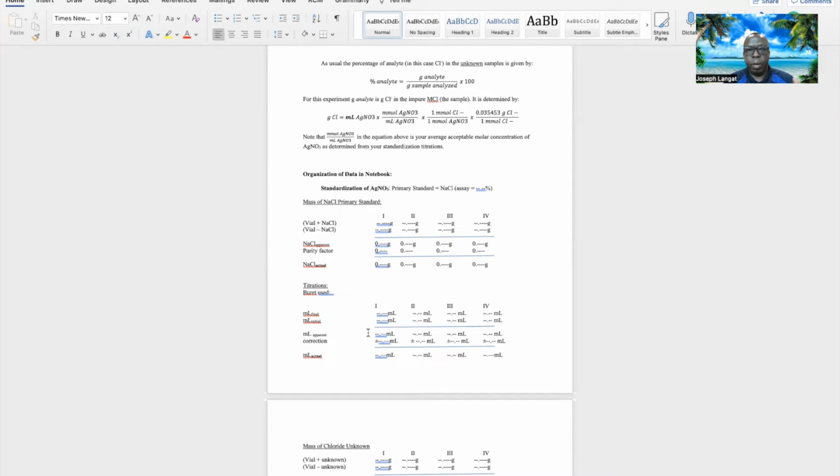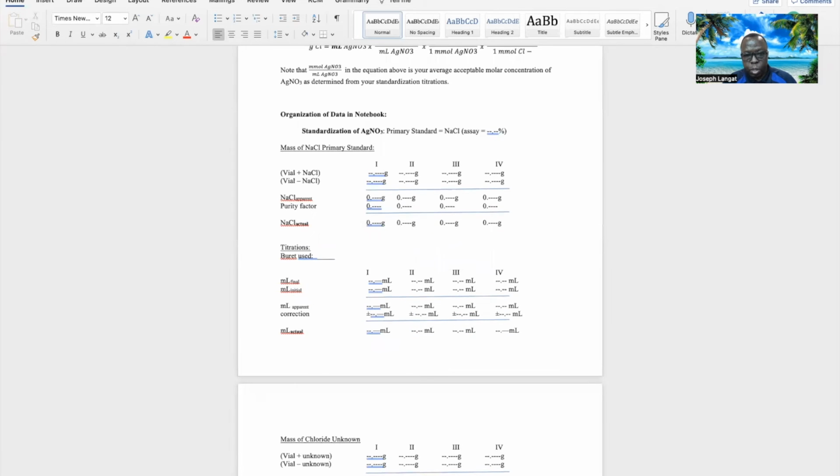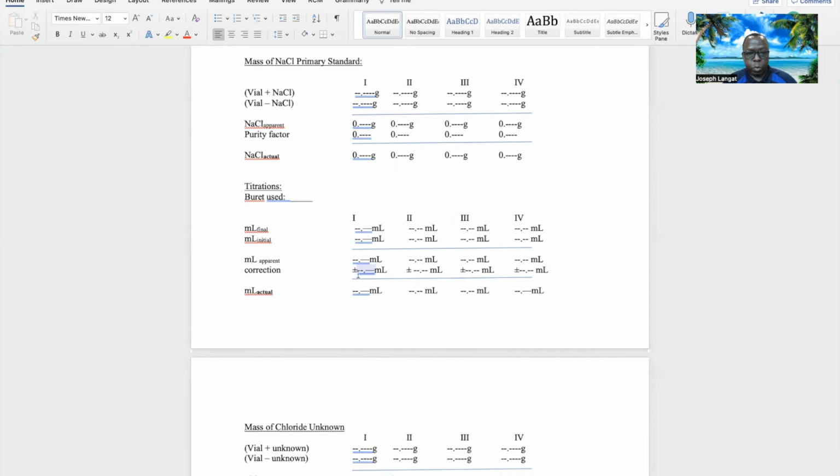I know in the lower level chemistry lab you took, the correction or the volume error from the calibration curve didn't really matter. There is plus or minus here. Some folks have their volume correction on the positive territory, some folks on the negative territory.